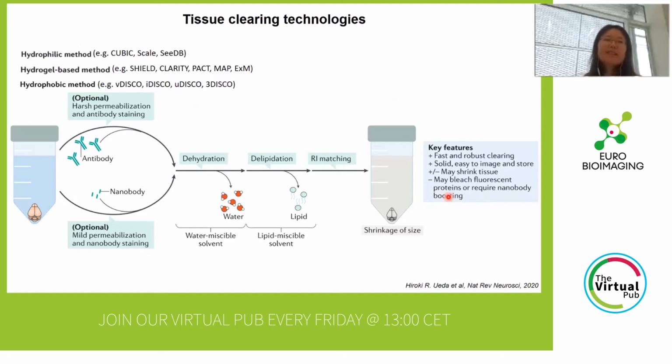In the last decades, more than 40 different kinds of tissue clearing technologies have already been published. They are mainly classified into 3 categories: the hydrophilic method, the hydrogel-based method, and the hydrophobic reagent-based method. This is also what we are mainly interested in.